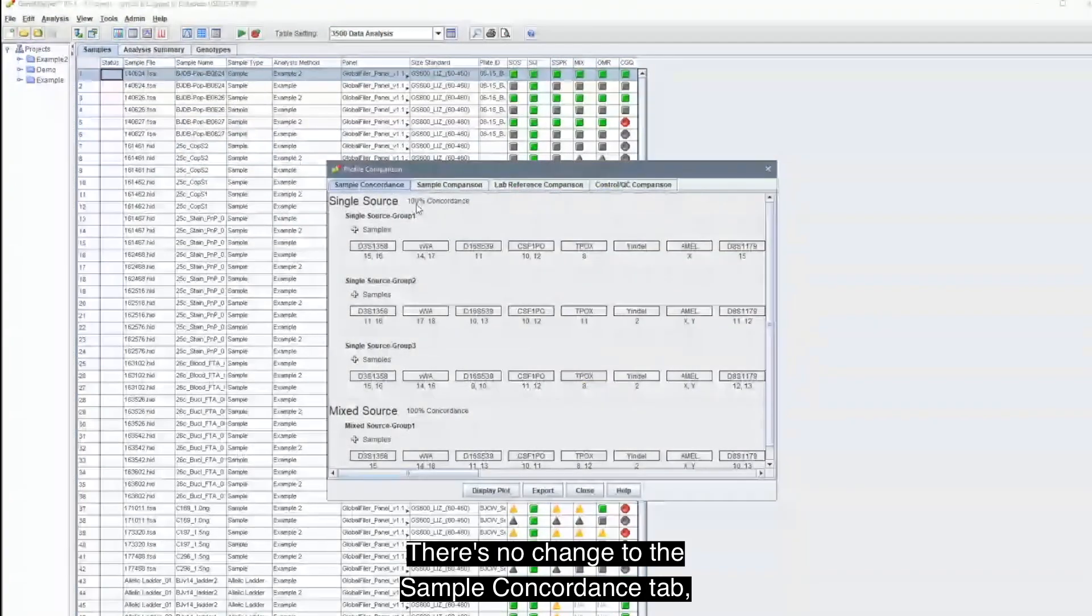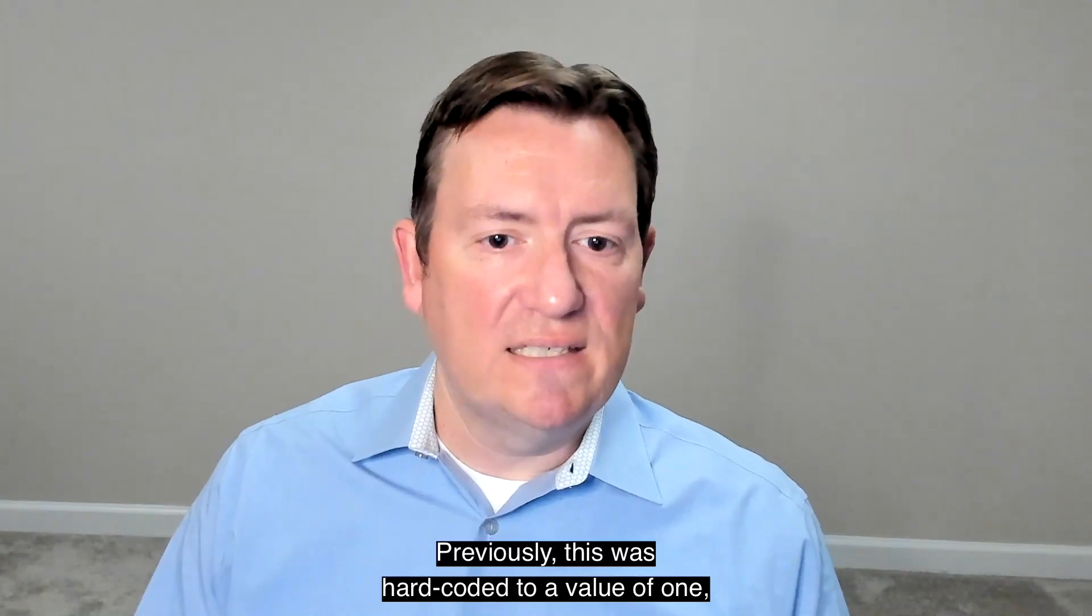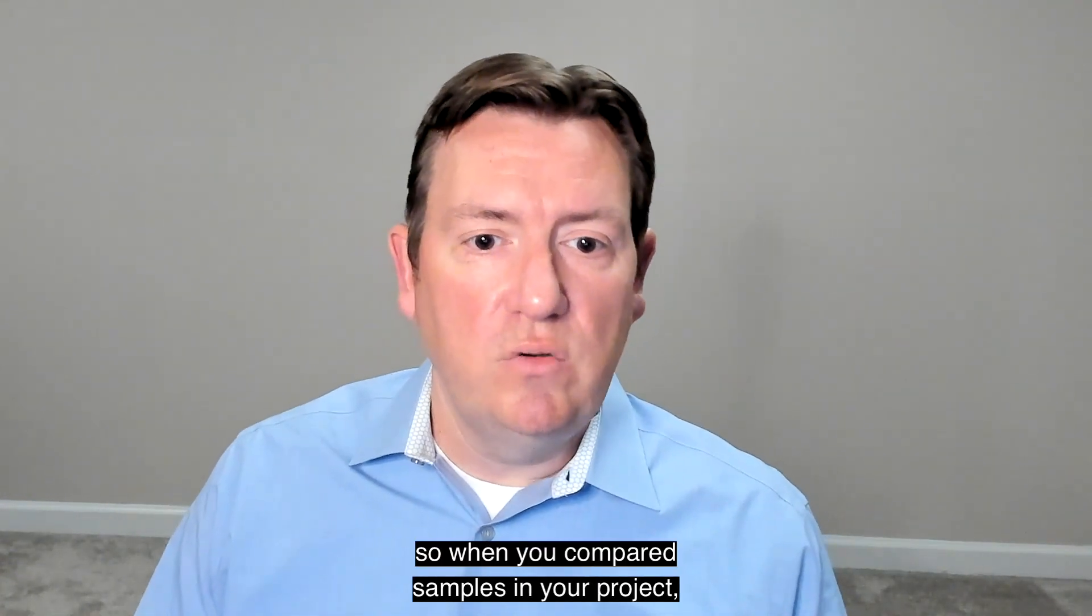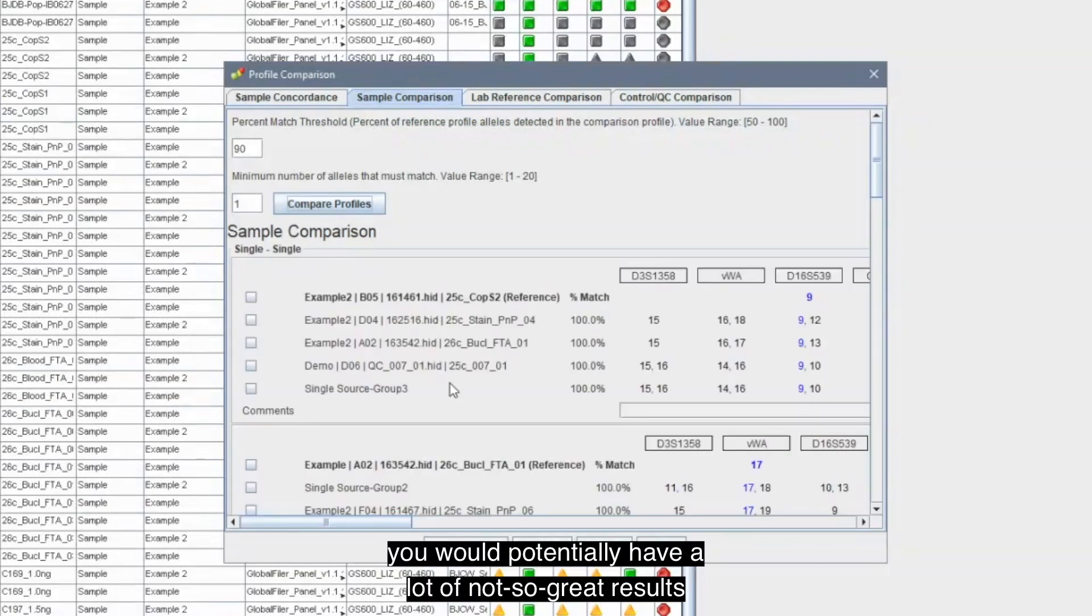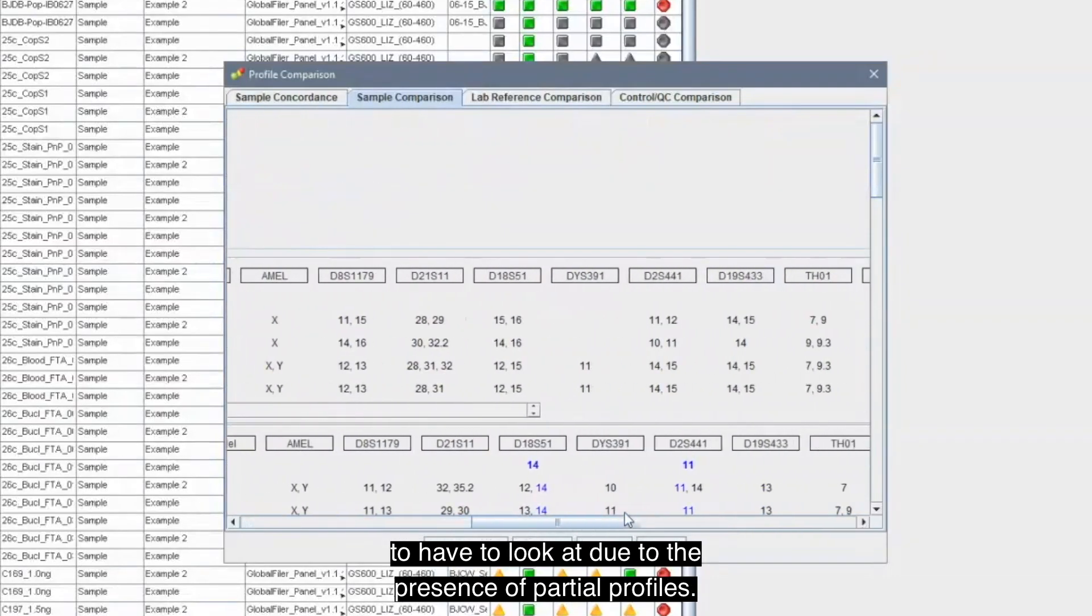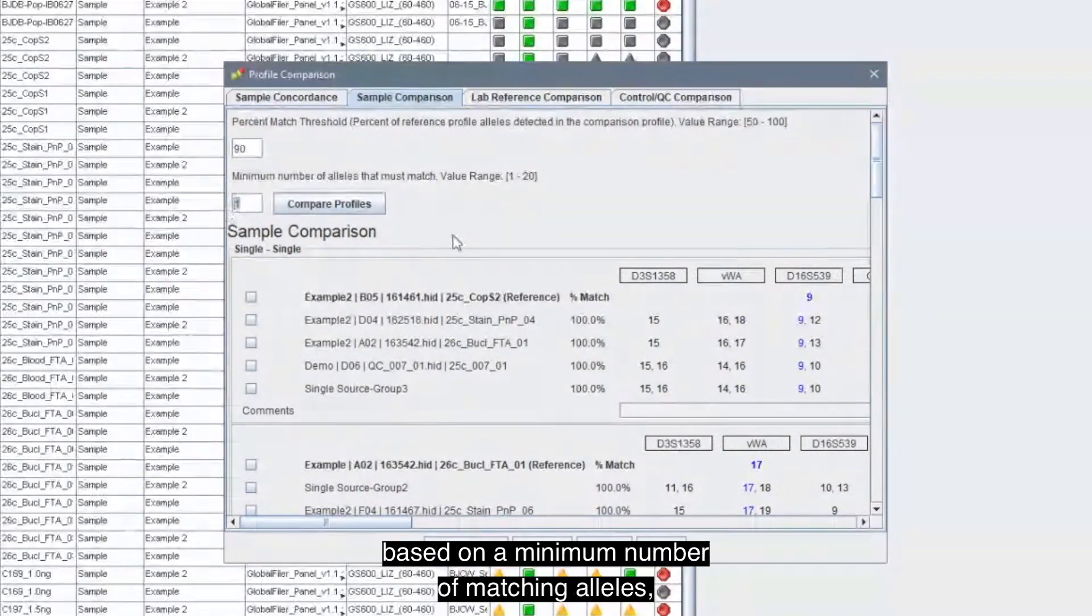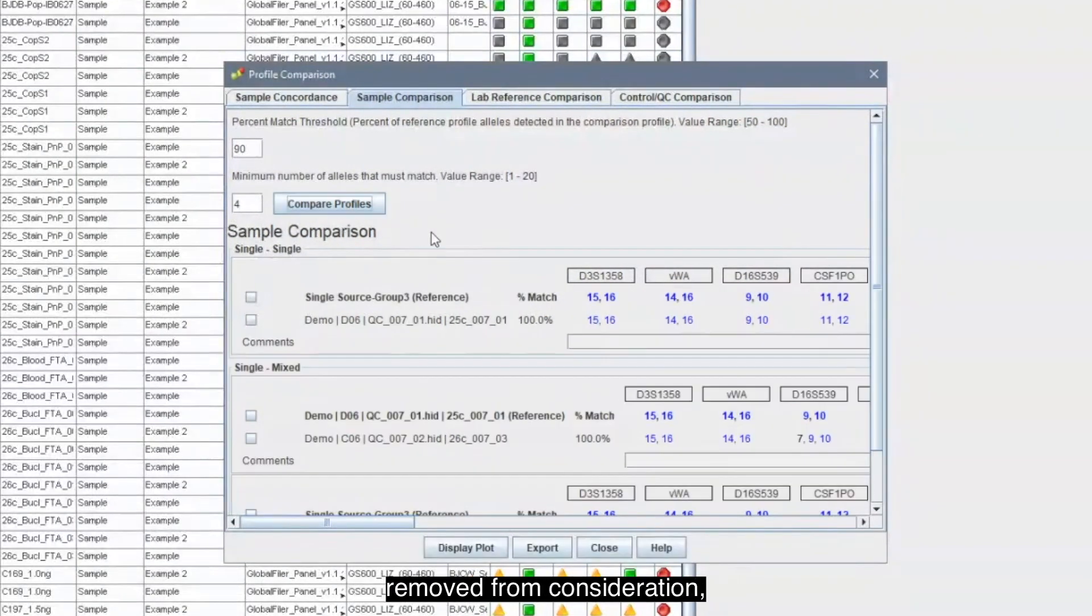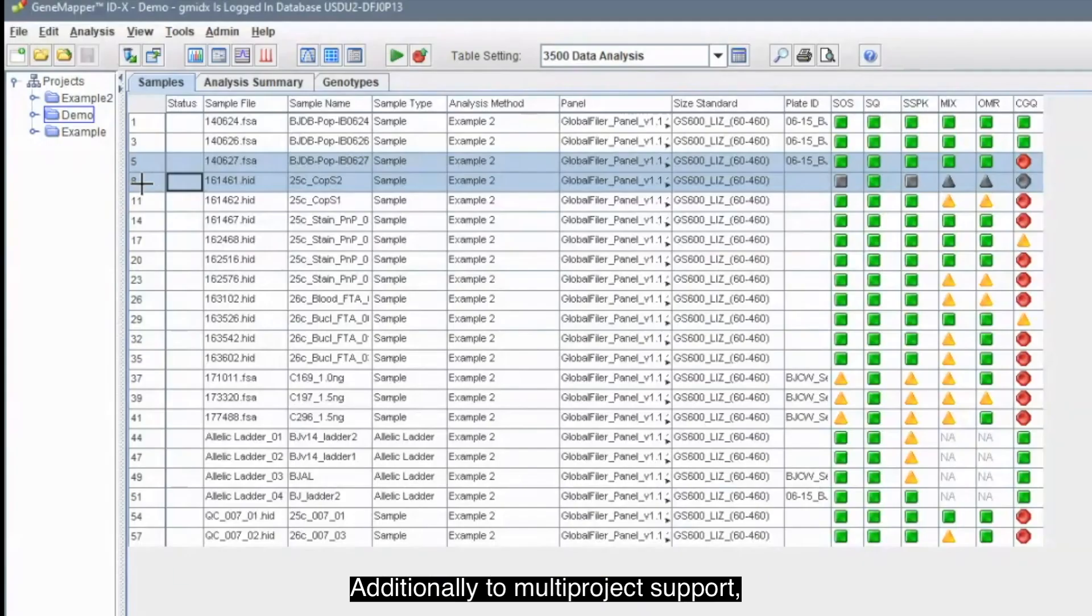Profile Comparison Tool will now look at all samples from all open projects for evaluation. There's no change to the Sample Concordance tab, but in the Sample Comparison tab, you'll see that we've now added a minimum number of matching alleles. Previously, this was hard coded to a value of one. So when you compared samples in your project, you would potentially have a lot of not so great results to look at due to the presence of partial profiles. Now, with the ability to filter your results based on a minimum number of matching alleles, you can have those partial profiles removed from consideration, making the process a lot easier and showing you only the results that matter.